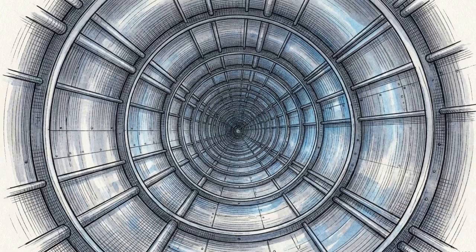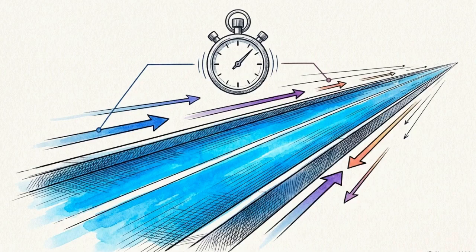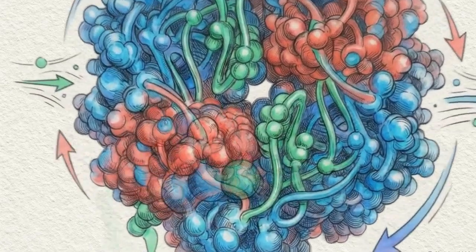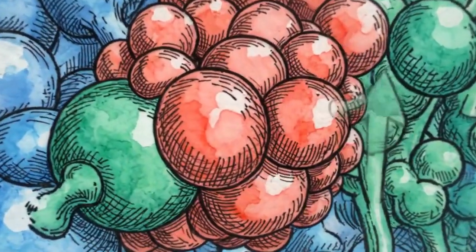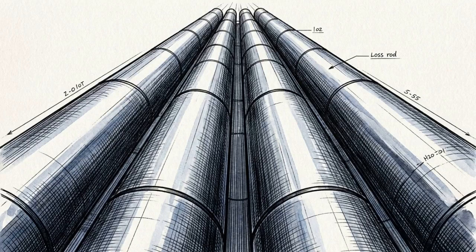Because it relies on a field-free vacuum, TOF boasts a practically unlimited mass range, routinely analyzing fragments over 100,000 mass-to-charge units, all while capturing data in fractions of a millisecond. Time of flight is the ultimate temporal racetrack. Its ability to handle massive, intact ions without losing them in complex electrical fields makes it the analytical standard for large biological molecules. The quadrupole mass analyzer abandons the vacuum foot race entirely.